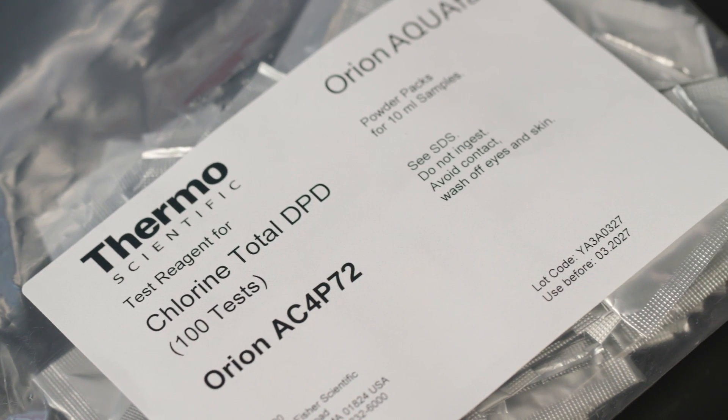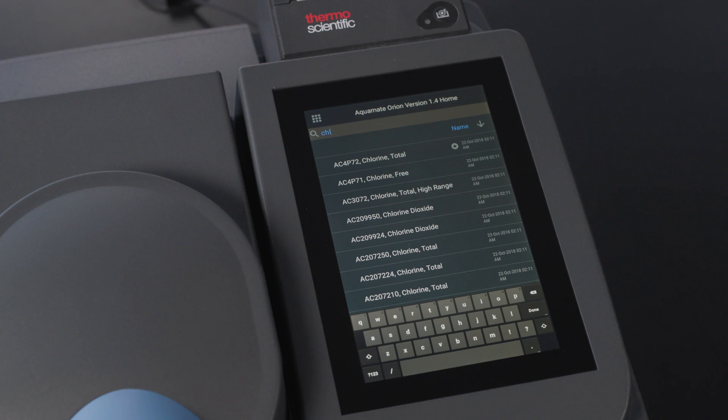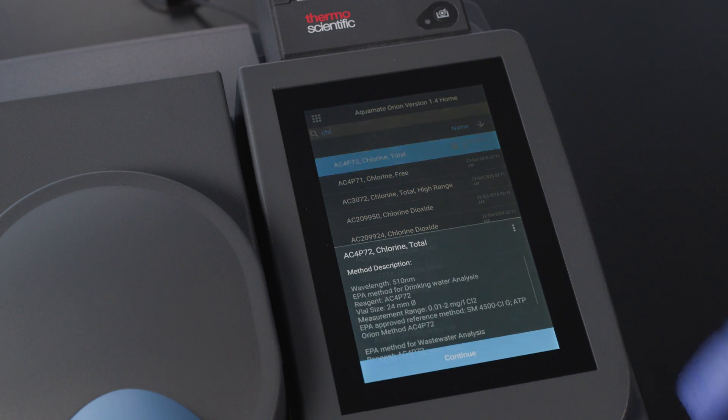We can select method AC4P72, which matches the catalog number of my reagent. When the method is selected, we will find that a lot of information is available in this first screen.